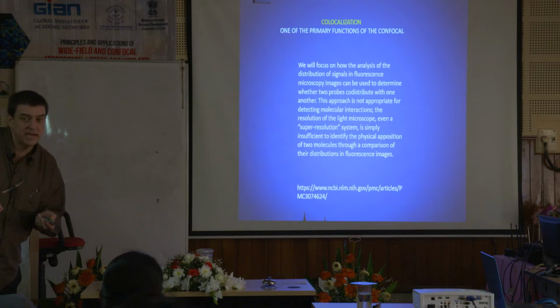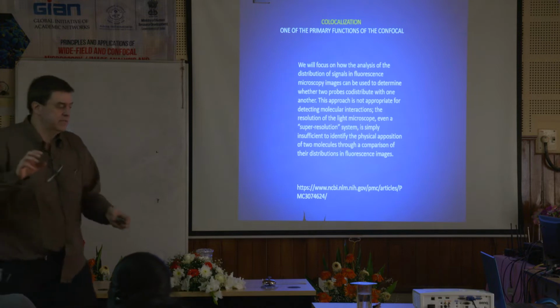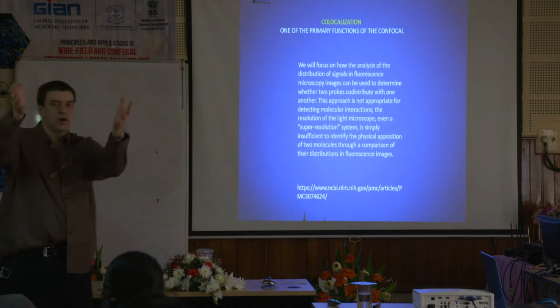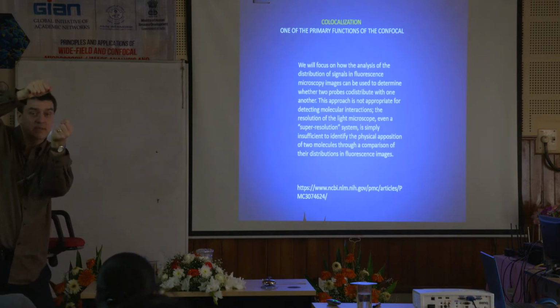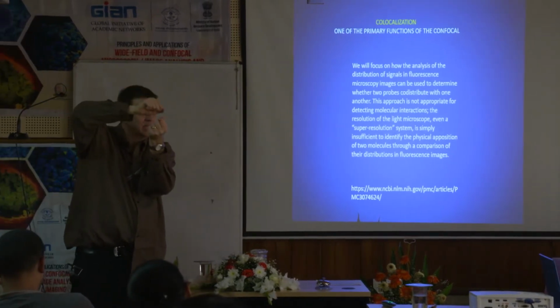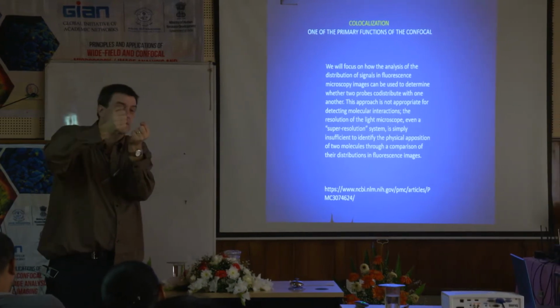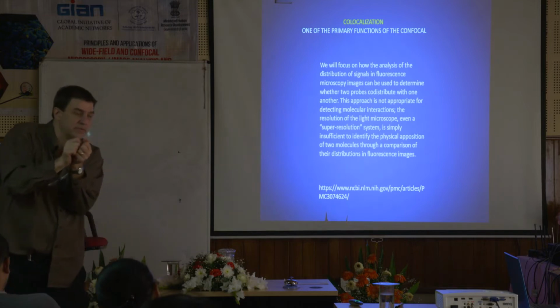You could have a rather large complex, with a protein here and a protein here. At the resolution, the ability to separate, it looks like they're in the same place. But that doesn't necessarily mean they're touching or interacting. Yes, they are very, very close, and they may be touching and interacting, but it does not prove that.